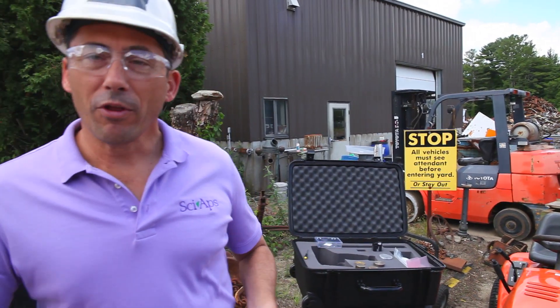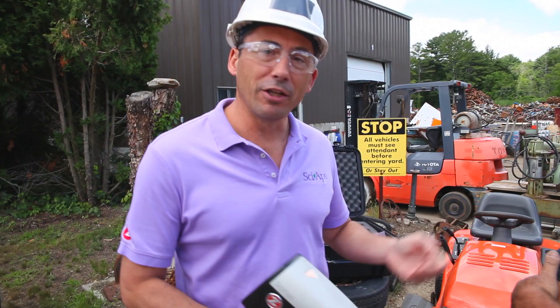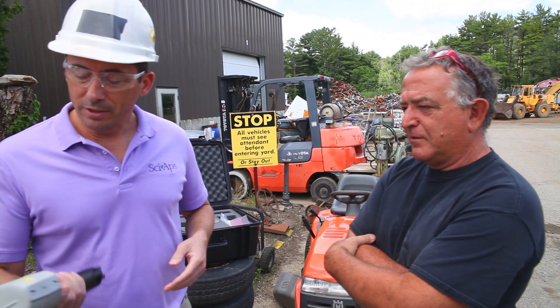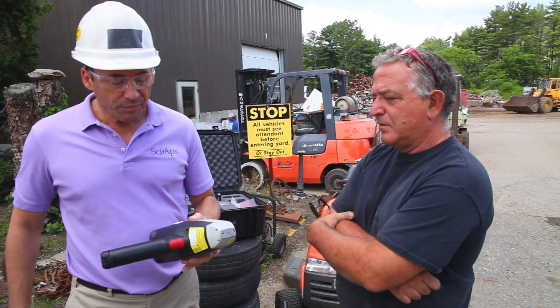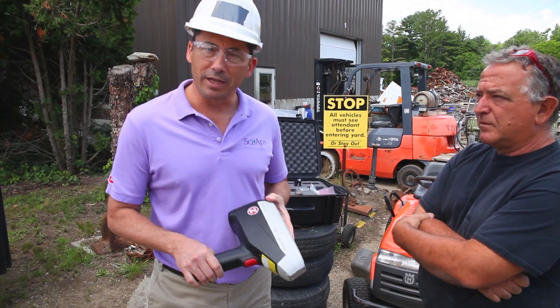We're here today at Wentworth Scrap Metals outside of Portsmouth, New Hampshire, with John Hebert, the owner of the business, to show them the new laser-based technology, the Z100, that uses a laser to analyze metals as opposed to x-ray.